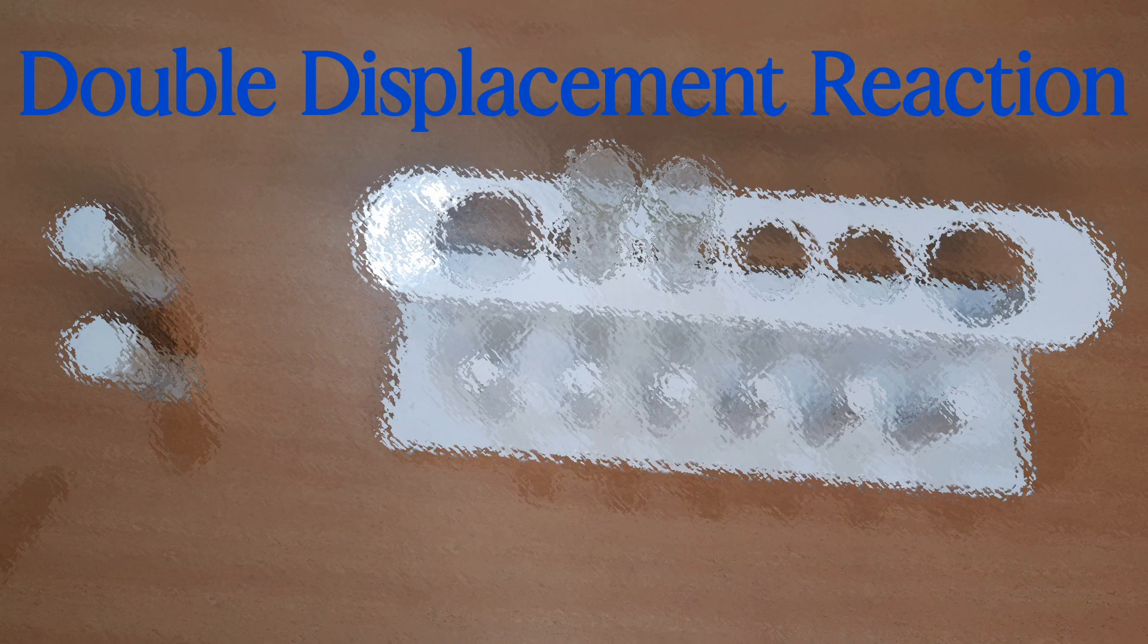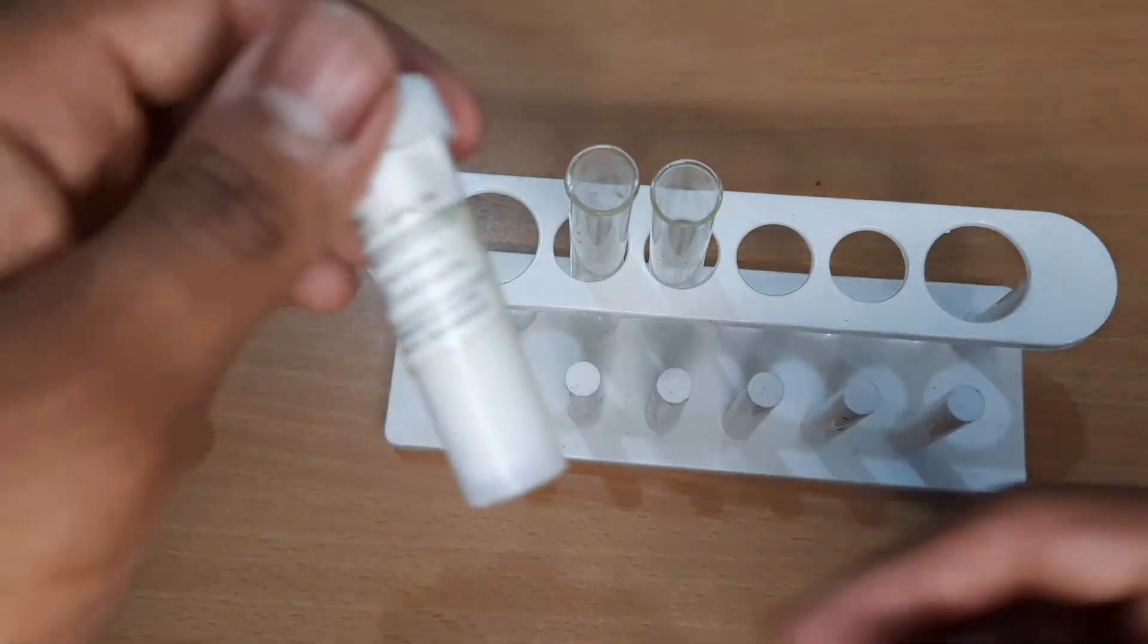Today we will see the reaction between sodium sulfate and barium chloride. For this activity we need barium chloride and sodium sulfate.